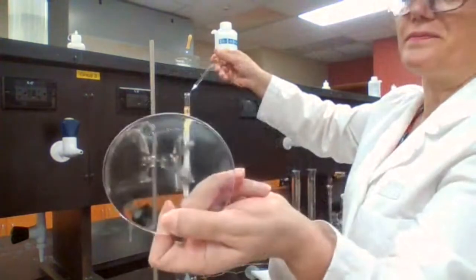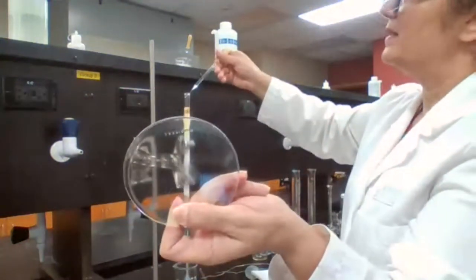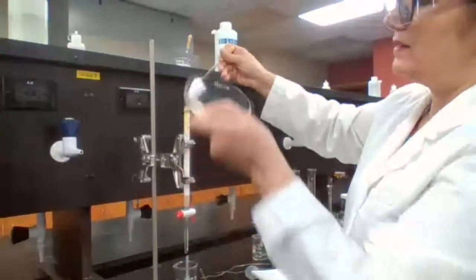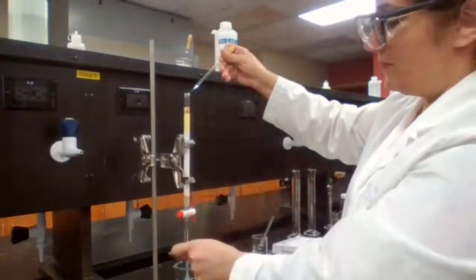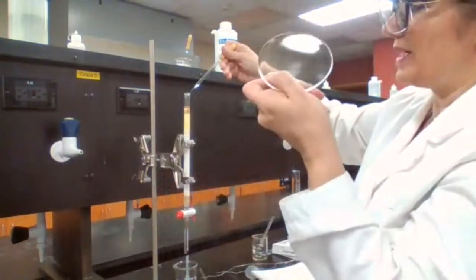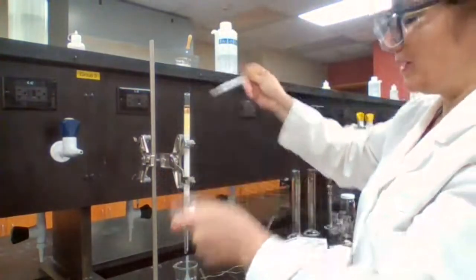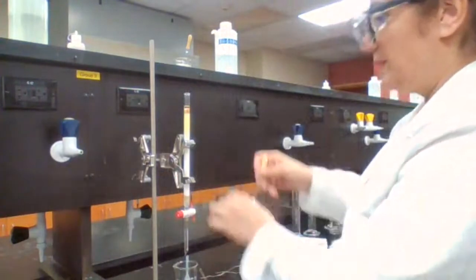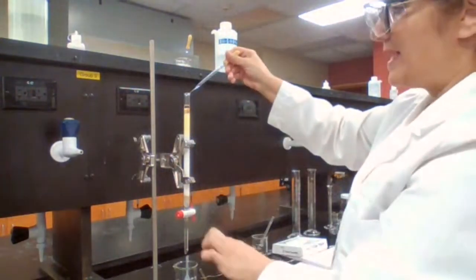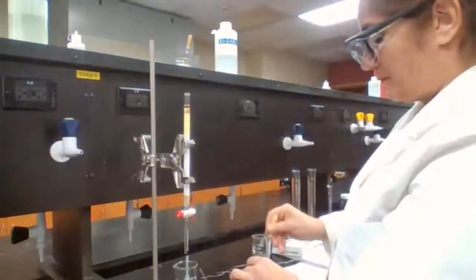It's clear, so it's just hexane. So I have to continue adding the hexane and continue testing. You see how often I have to test to make sure that I'm not going to miss when the hexane carries the fluorene.